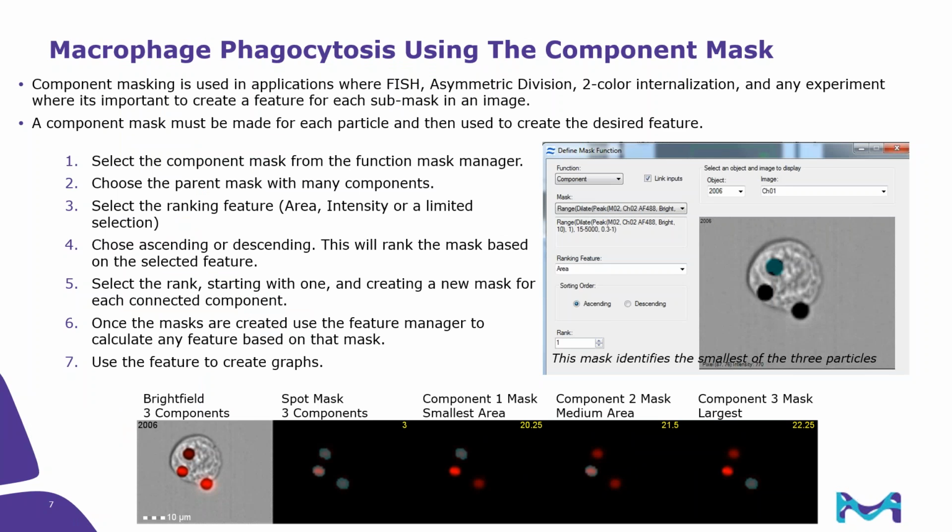Now, one of the key enhancements that we've done lately is what we call component masking. And those of you who are familiar with IDEAS but maybe haven't taken the time to learn about component masking, I would encourage you to do so. It's a really powerful tool. And essentially, the tool came out of the need to characterize components within a single image.